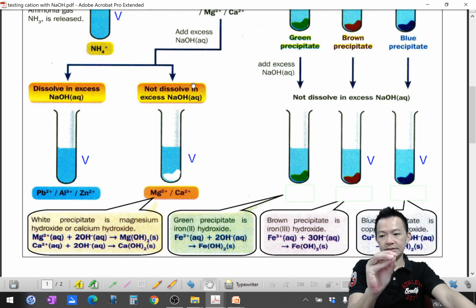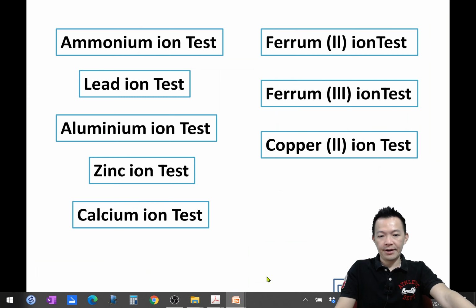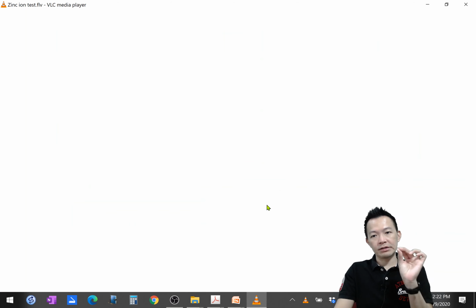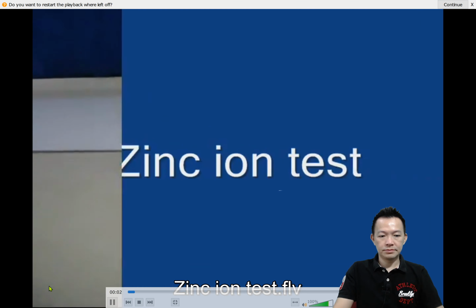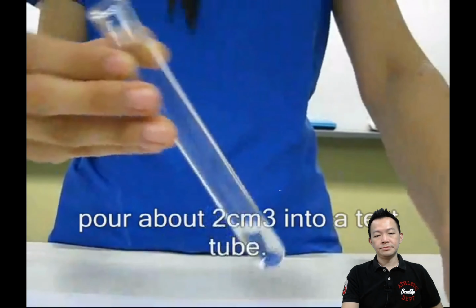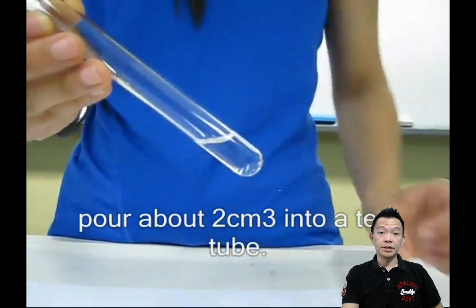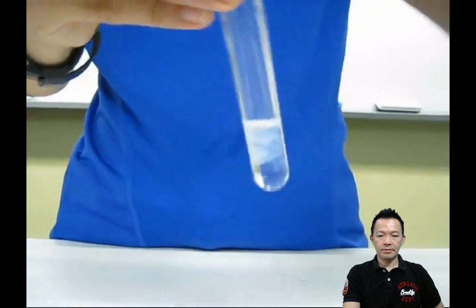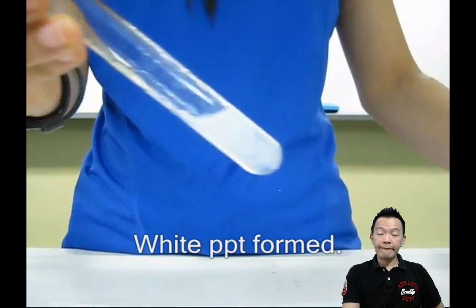You hold on the page number 33, 你就挡在你的 page number 33, 不要走开. I show you the video 啦, 给你明白这个意思是什么呢? Okay, I show you the test. Let's say aluminium or zinc test. 我给你看zinc, okay. Test with sodium hydroxide, zinc是怎样的呢? Okay, prepare zinc solution. It can be zinc chloride, zinc nitrate, zinc sulfate, 什么都可以. Add a few drops of sodium hydroxide. White color precipitate will be formed, 对不对? 白色的 precipitate 会形成. Add excess, 加多多怎样? 自己看.